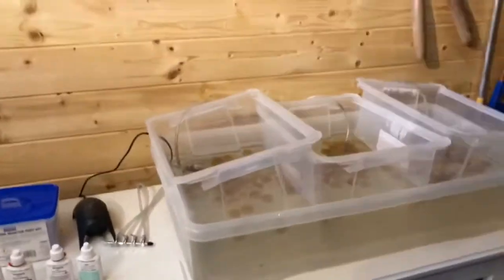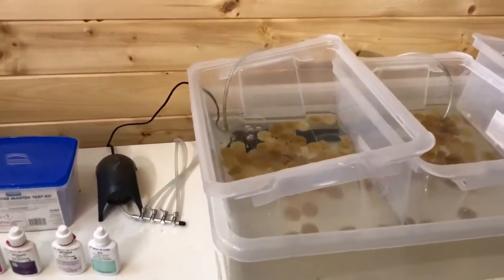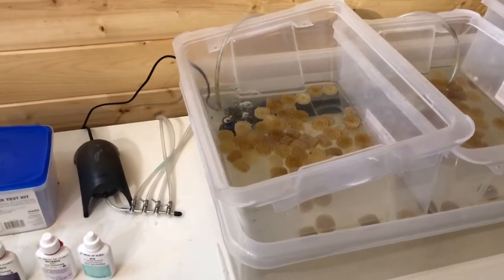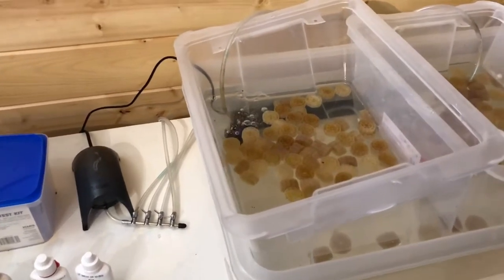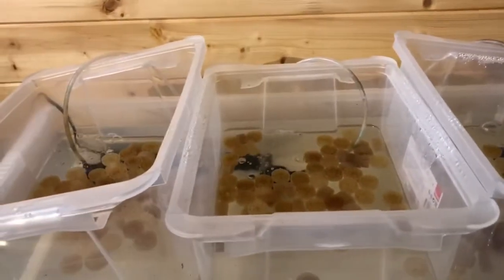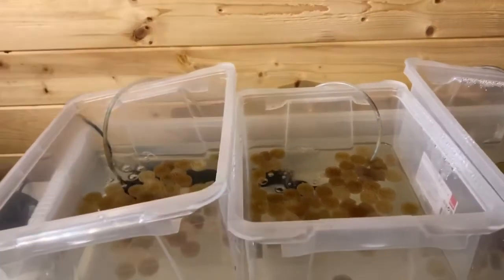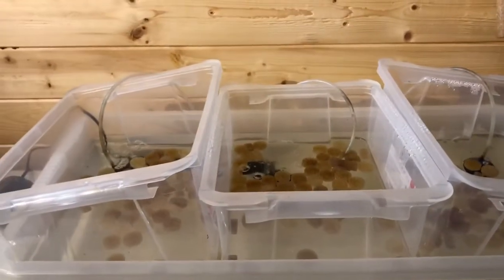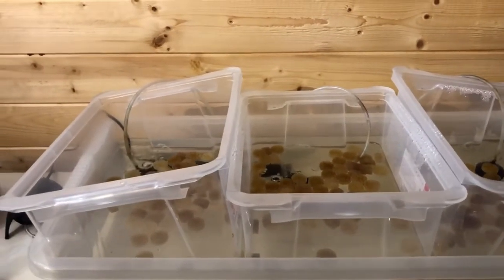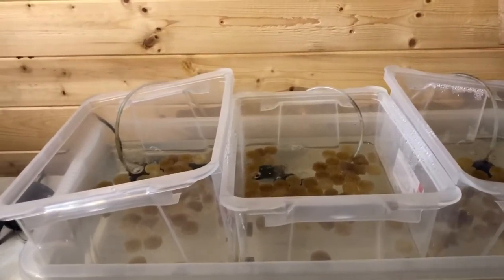And so what's the difference going to be between these 3? Well, this one, I'm just going to leave it as it is and just continue adding the ammonia and see how much nitrate develops over time, and also measure the carbonate hardness going down. This one here, I'm going to do 10% water changes. For every time I add 5 milligrams of ammonia per litre, I'm going to do a 10% water change before I add the ammonia. Which will simulate what it's like doing your weekly water change with your pond.